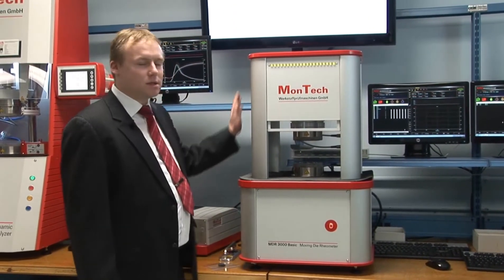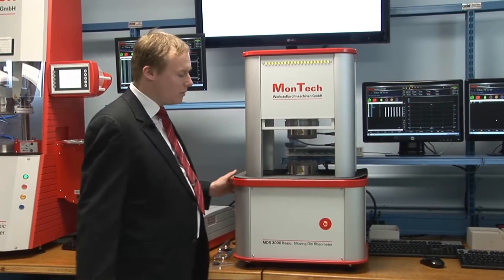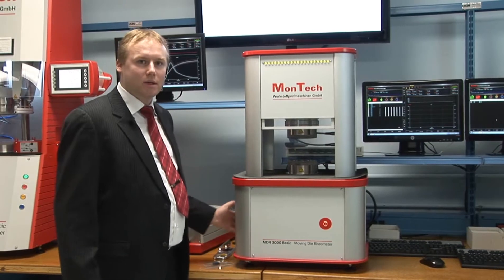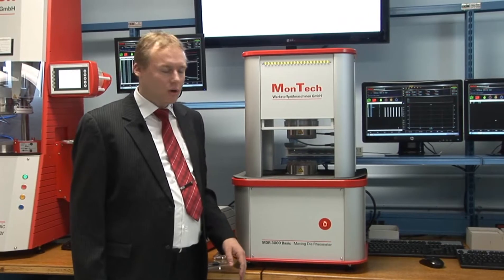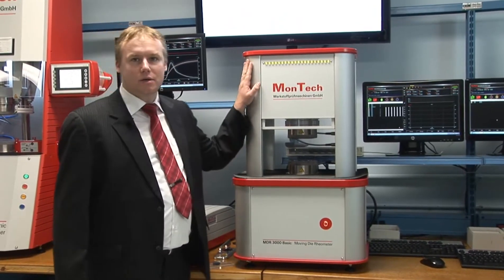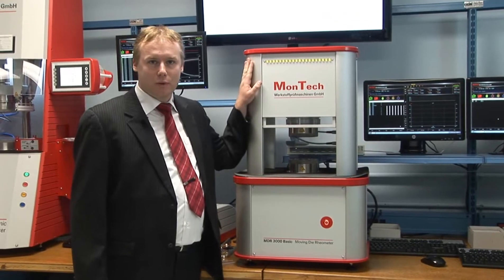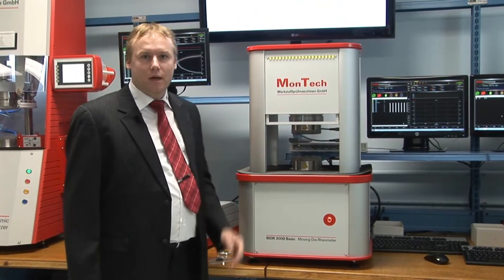The machine itself consists of a very heavy duty machine body with all metal covers, fanless design, integrated electronics and PLC controller, as well as a single button operation and a status bar on top of the instrument. Of course the instrument comes with an automatic safety shield.